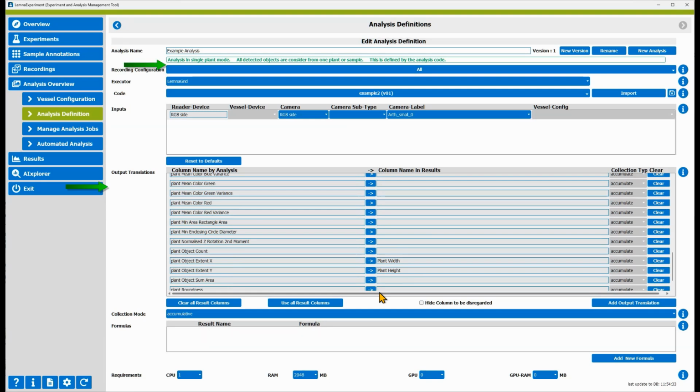You may have noticed the red error message is gone now. Please note certain parameters, such as mean color red, have only meaningful values if you add the appropriate properties device to your grid. In this case, the mean color property device. If you send a grayscale image to a mean color property device, it still will report mean color red, mean color green, and mean color blue, but they will all have the same value.